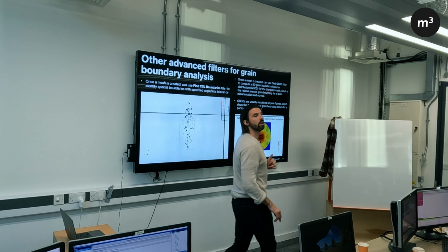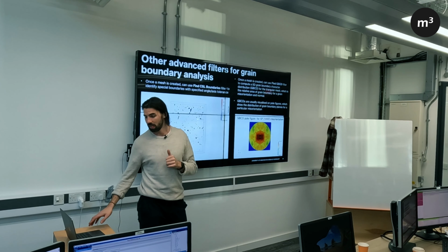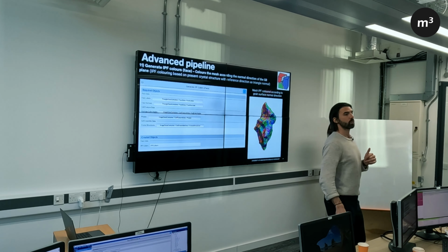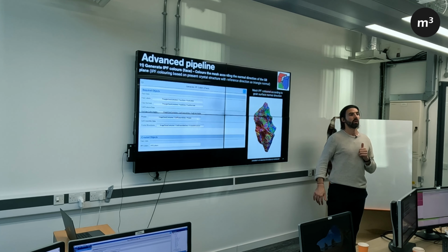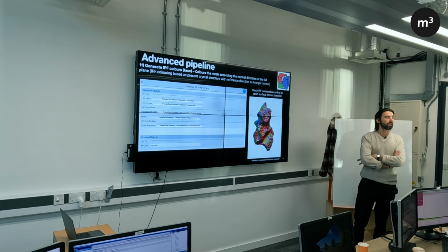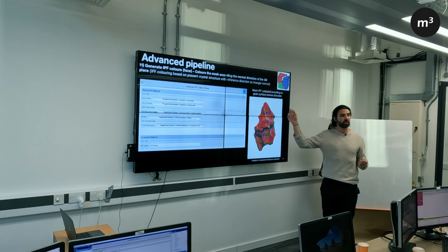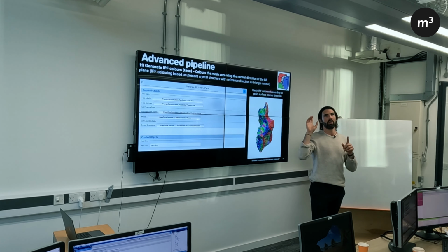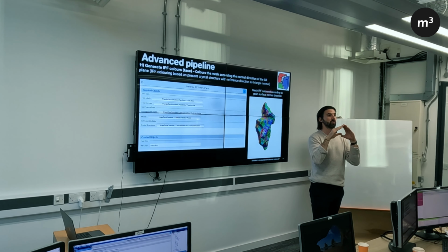It's not around each grain as you're showing, is it? It's the boundaries that are being meshed, and then it's putting together for that image. Yes. Because if you meshed each grain, they might not necessarily stick together. So it's a boundary. We'll show that when I show the visualization next. Each grain boundary will have two features. Each mesh segment will have two feature IDs associated with it. One will be the grain on each side.